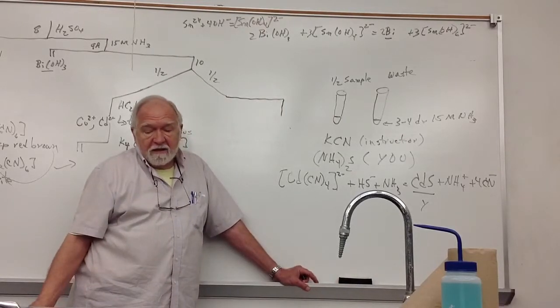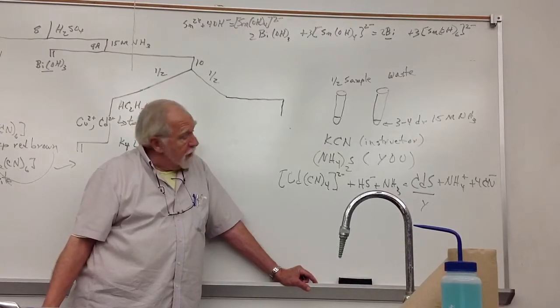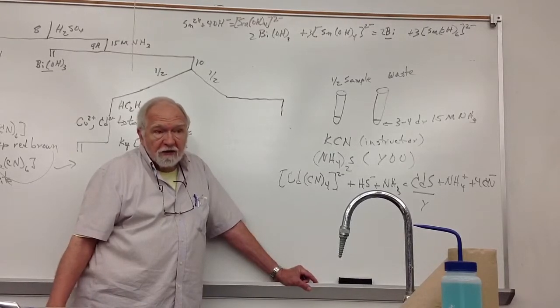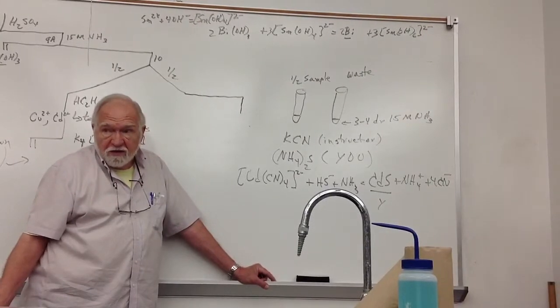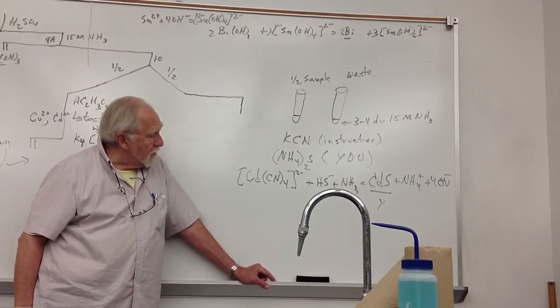Unfortunately, it's easily contaminated. If you didn't get rid of all your ions along this way here, you usually get, instead of something bright yellow, something brownish yellow. That's the lead, the mercury and things, all those little residues sort of try to overpower the yellow color from the cadmium salt. That's your confirmatory test.